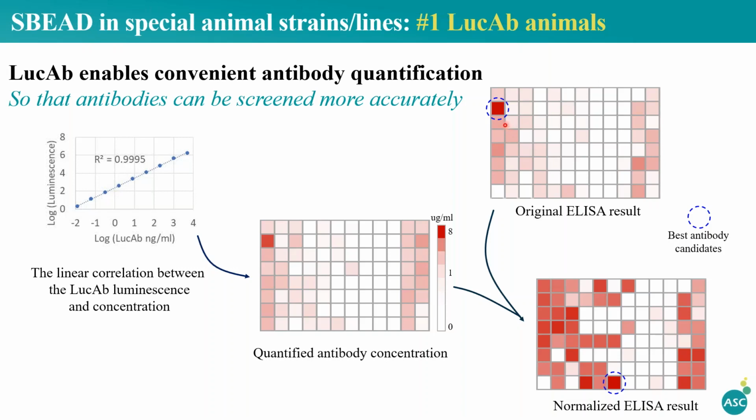when a typical 96 well plate screening ELISA assay was carried out, the assay identified one well with the strongest signal. Usually, this well will be selected as a candidate and moved to the next stage. By adding back the medium, the same amount of medium used in the ELISA, we can read the plate again.